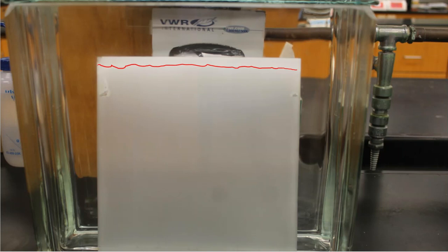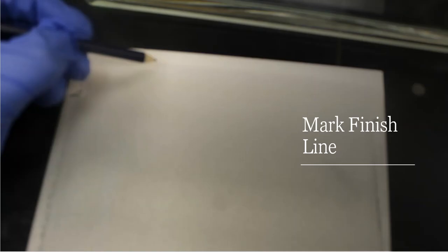So that's ready to be taken out. So I take the lid off of that chamber. I take the plate out. I lay it down onto my lab counter with the silica side up so that way it can dry. But the very first thing that I want to do is mark the finish line. I know this picture is kind of out of focus, but you can see the dividing line here between the dry silica and the wet.